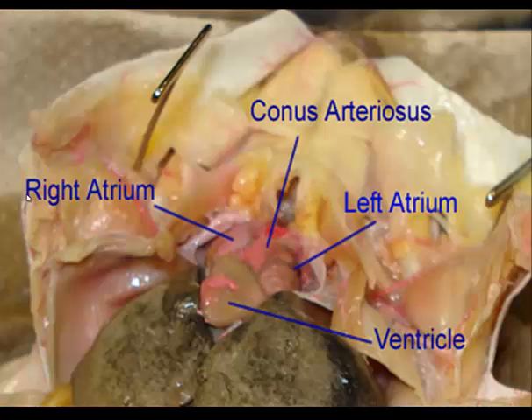To find the conus arteriosus, it's a single wide artery that leaves the ventricle and passes over the right atrium. If you follow the conus arteriosus forward, it'll divide into three branches on each side.